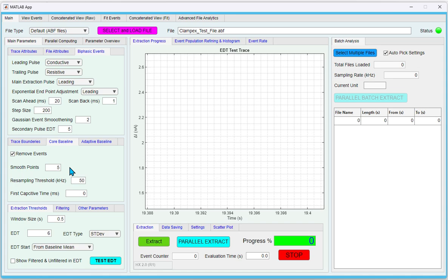There are two possible scenarios. One clear peak. The baseline is centered on one prominent peak. The program then keeps points within 3 standard deviations of it. Everything else is probably a spike or event. Multiple peaks. The program looks at how fast the signal is changing. Points where the signal changes rapidly are flagged as events and thrown out. What's left is the baseline. From the surviving baseline points, the program computes the mean and standard deviation.